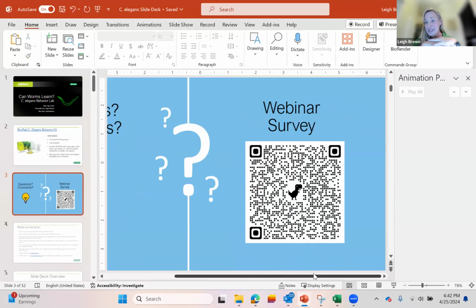The other one that's fun for students to do, and this doesn't have anything to do with chemotaxis or wild type and mutants, they'll both react this way, is they're sensitive to touch. The way they usually do a worm poker is they take a little toothpick, so pretend this is a toothpick, and you can pluck out an eyebrow hair and glue it onto the bottom. So now you have a little toothpick with your eyebrow hair. The green screen isn't doing me any favors. Like that. Then you can poke them on their nose or their tail, and they'll move away from that. So that's a fun one too, if you're into light worm torture. It doesn't kill them. So that's kind of neat.